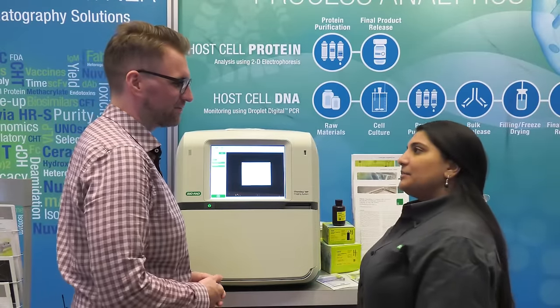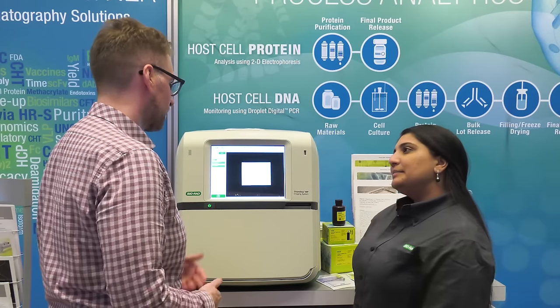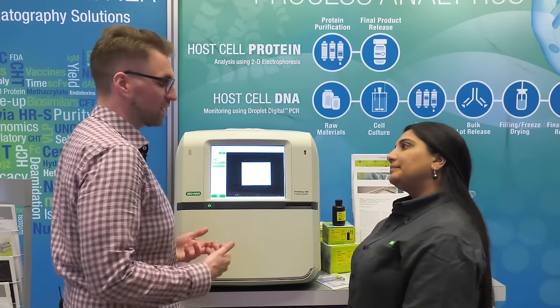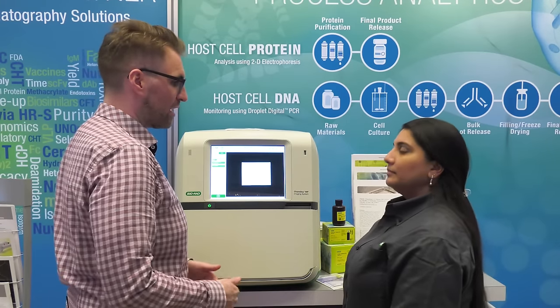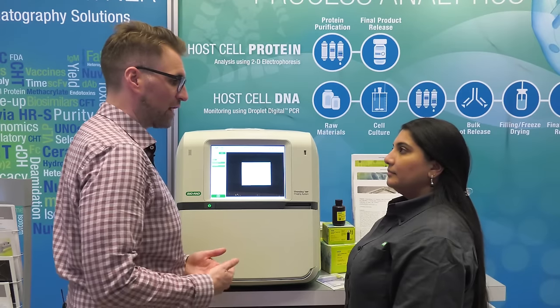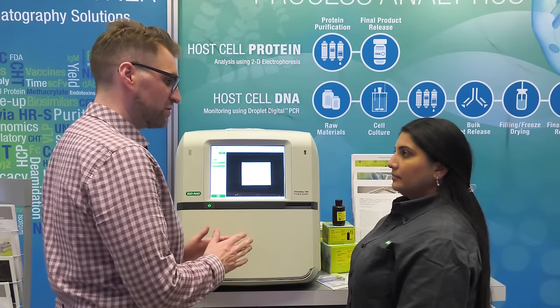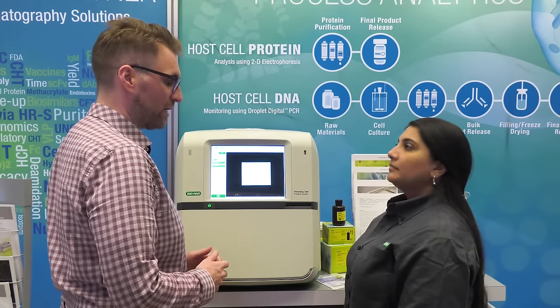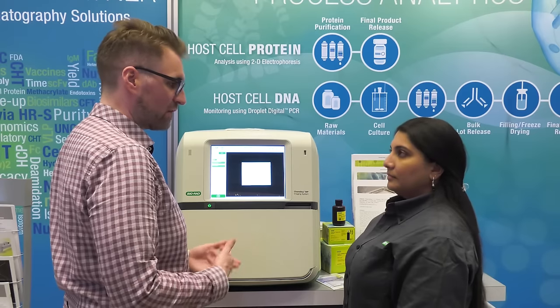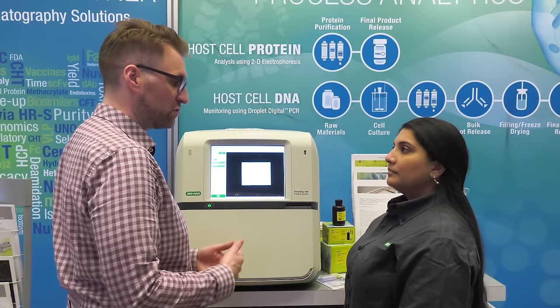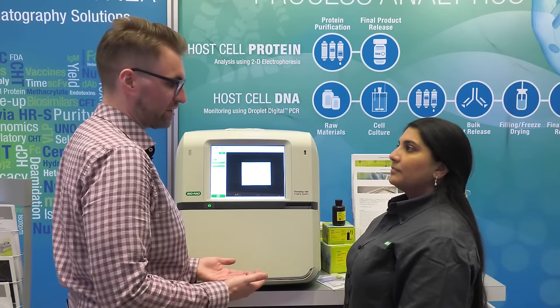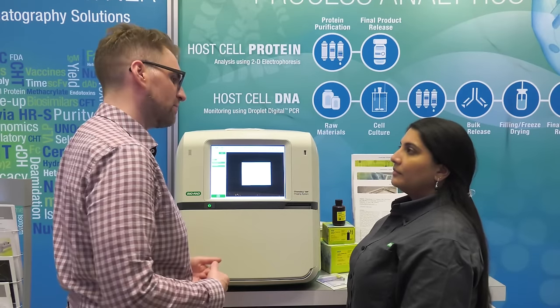What are customers looking for in their digital imaging systems these days? It's a great question. It really comes down to flexibility here. Back in the day, researchers would go ahead and buy a single imaging system just for a single application. And that can be great, there are some benefits to that, but isn't it better to have a system that can do all these different things here as opposed to having three or four systems that you have to maintain and take care of?